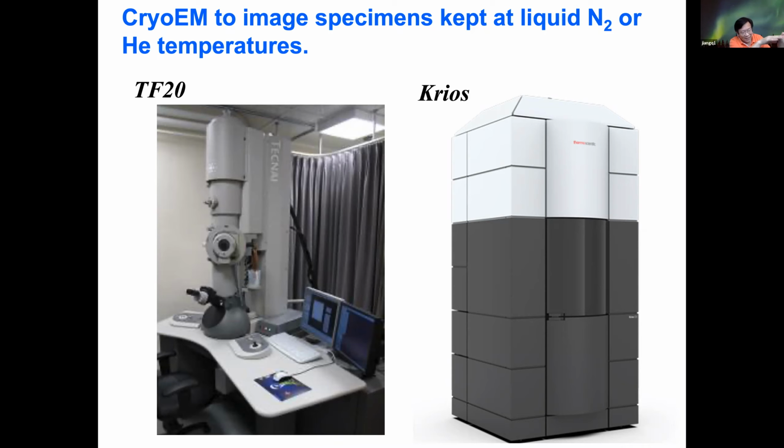The microscope can then take images from the specimen while it is maintained at near liquid nitrogen temperature, such that we can collect images of the particles in suspension. As I mentioned, because of the retention of the atomic resolution information of the specimen, the micrographs contain high resolution information. This can then be used for computational analysis.